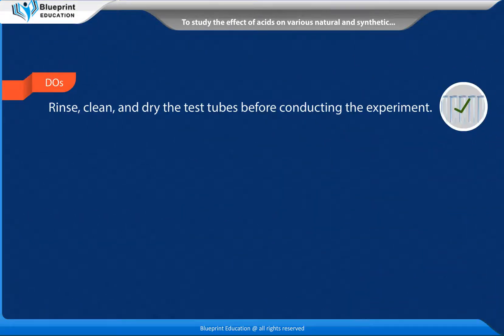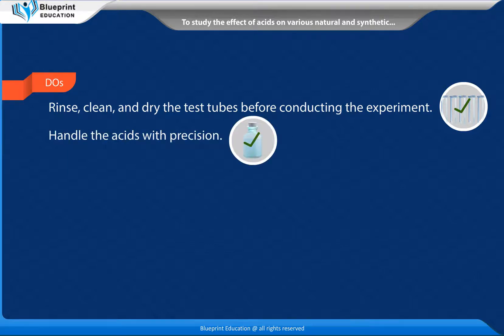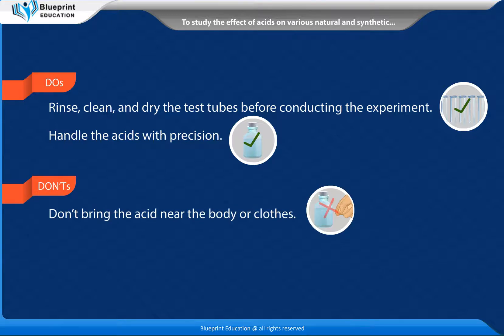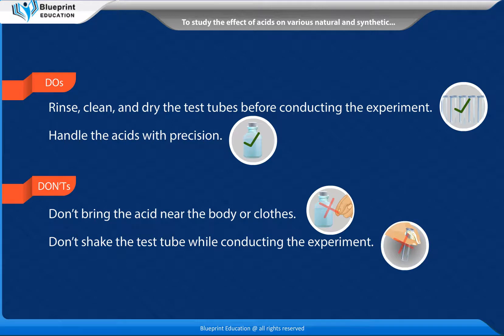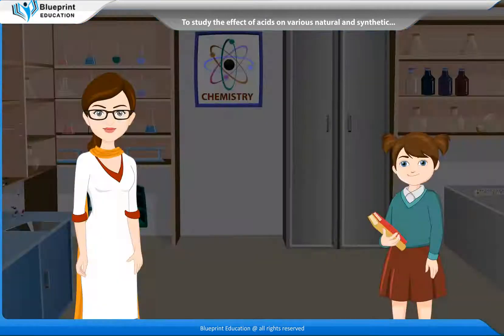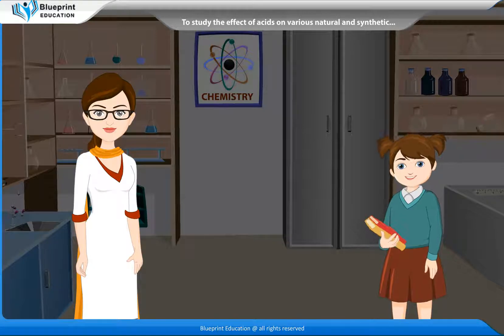Dos: Rinse, clean, and dry the test tubes before conducting the experiment. Handle the acids with precision. Don'ts: Don't bring the acid near the body or clothes. Don't shake the test tube while conducting the experiment.